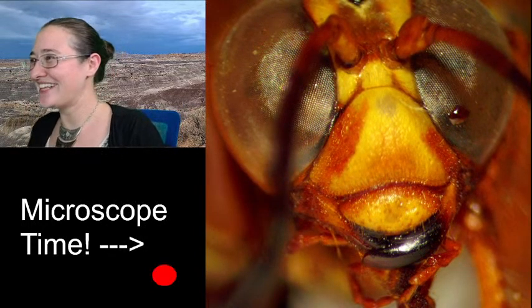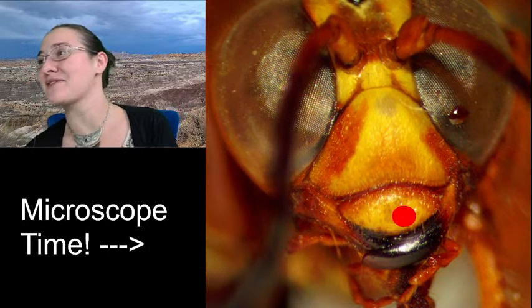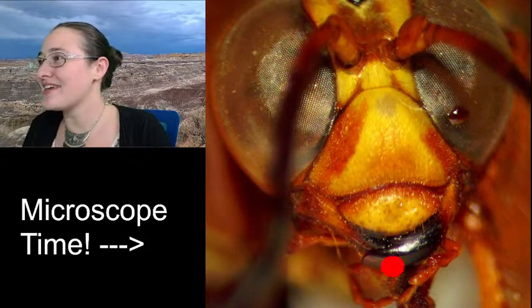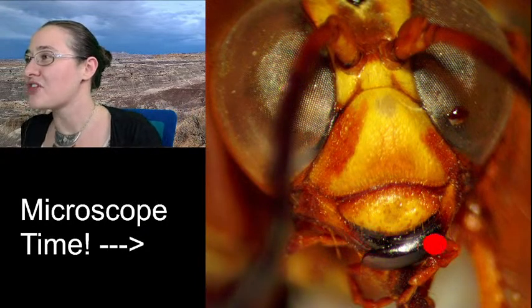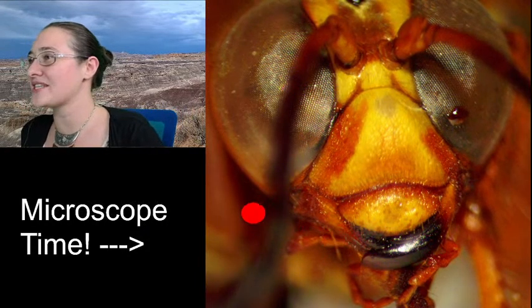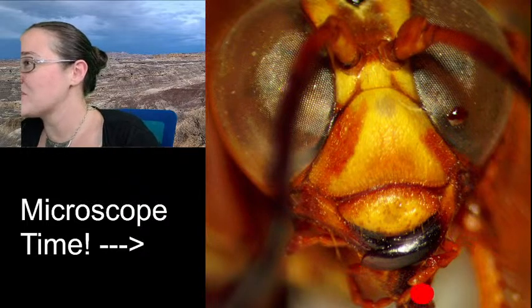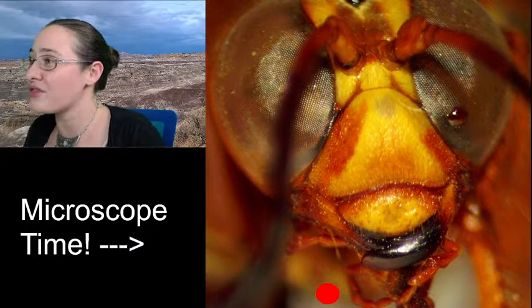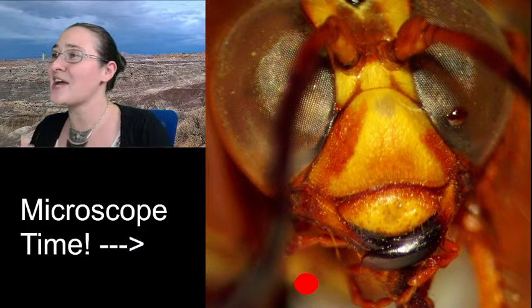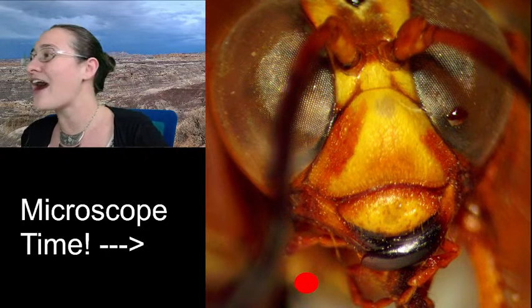She's beautiful. Alright, so right here, you're looking at the upper... This little segment right here is the upper lip. That's the labrum. These right here that are dark and shiny and super sclerotized, those are the mandibles. Those are the chewing mouth parts that they're going to use to chew on all of their foods, and they're predatory, so those are sharp and strong. Then, what looks like a bunch of little segments here, those are part of the mouth. Those are palps. And depending on where they're connected, they can be either maxillary palps or labial palps, but they're all mouth fingers.